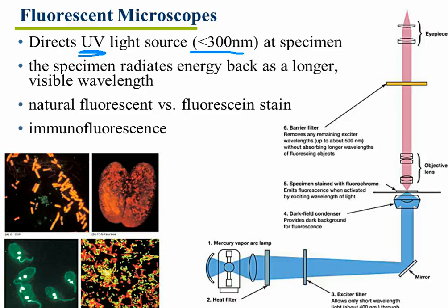Now, here's the light microscope setup down here. We are using UV light. Now, UV cannot be seen by us; we don't have receptors for UV light. This is UV light in blue. You see it right there. This is a very different microscope than our scopes. Got a different kind of lamp. Okay, so there's the UV light, and it hits your object. Your object is sitting right here on a slide.